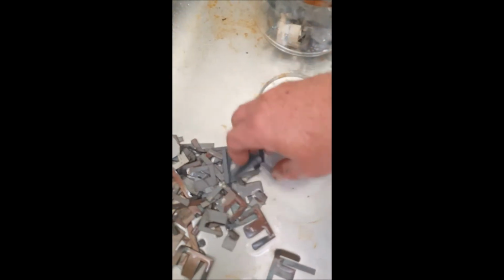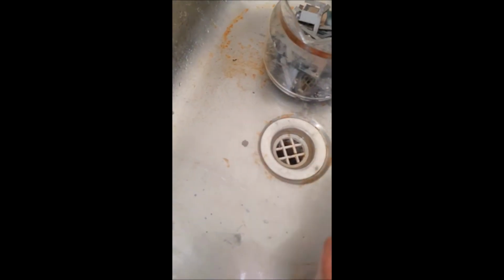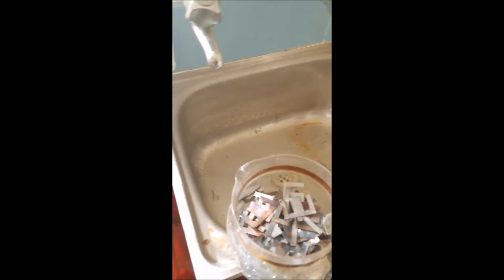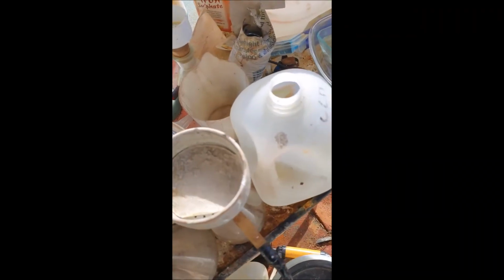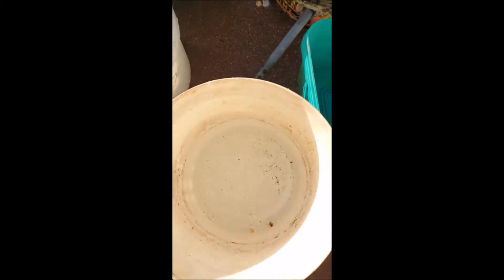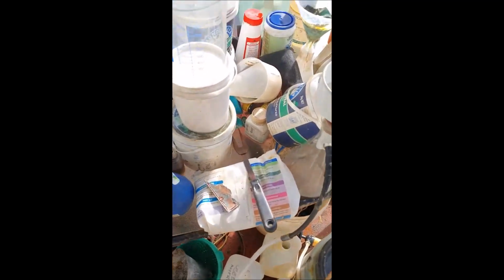Sorry, I keep looking at what I'm doing and not looking through the phone. Right, so now they're all back in the pot, and we'll go outside and put some chemicals in there. It's been raining out here and stormy, which is good because it's collected me some nice fresh rainwater. I put all these buckets out here to catch the rain. Saves buying distilled water when you can get rainwater, huh?